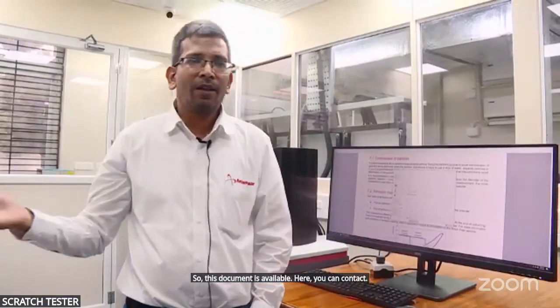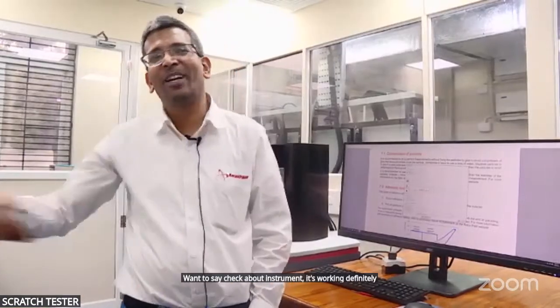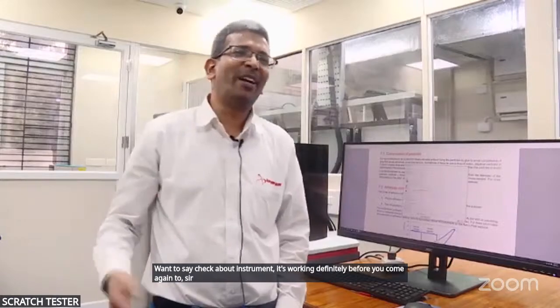So this document is available here. You can contact Professor Amitava Ghosh if you don't have it. And if you want to check about the instrument, whether it's working, before you come again to sir, I always recommend go through the manual.